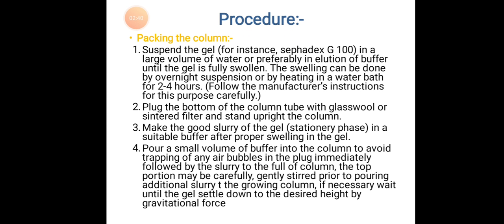Procedure: packing the column. Suspend the gel, for instance Sephadex G, in a large volume of water or preferably in elution buffer until the gel is fully swollen. The swelling can be done by overnight suspension or by heating in a water bath for 2 to 4 hours. Follow the manufacturer's instructions for this purpose carefully. Plug the bottom of the column with glass wool or a sintered filter and stand the column upright. Make a good slurry of the gel stationary phase in a suitable buffer.